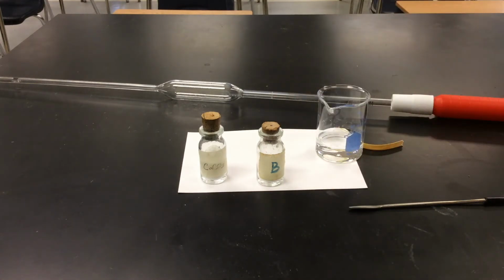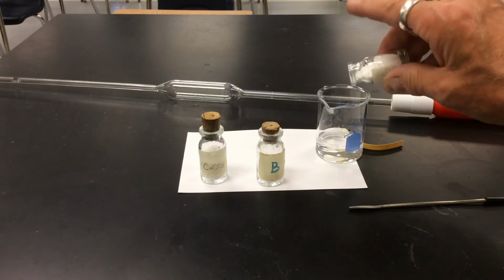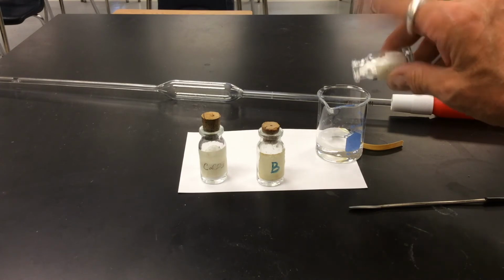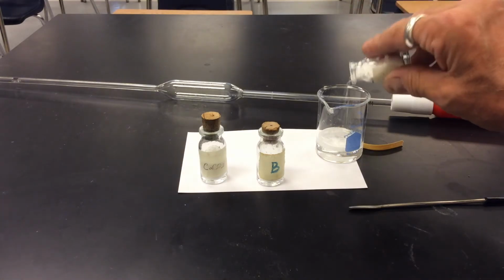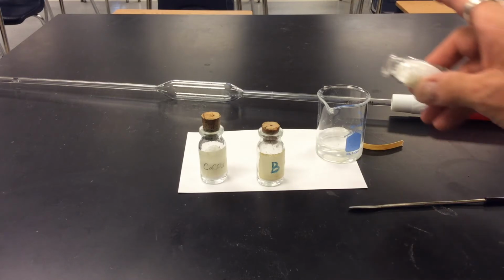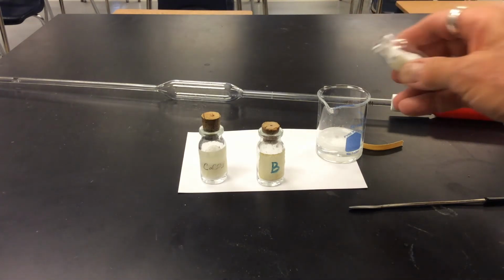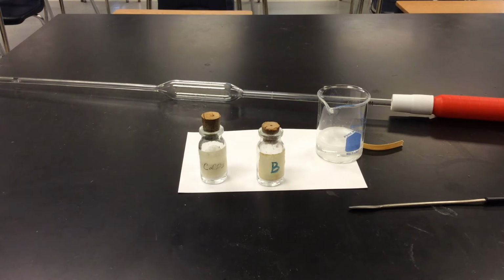Here's what the lab looks like if you set up your 10 milliliters of monoprotic acid and then you add the carbonate. You will start seeing the reaction happen. You will see bubbles, you will see fizzing. And I always have my students answer the question, I think it's number 5 in the pre-lab, how much should you expect magnesium carbonate or calcium carbonate to react if we have exactly 10 milliliters of approximately 1 molar strong acid. So they actually have to do a calculation.